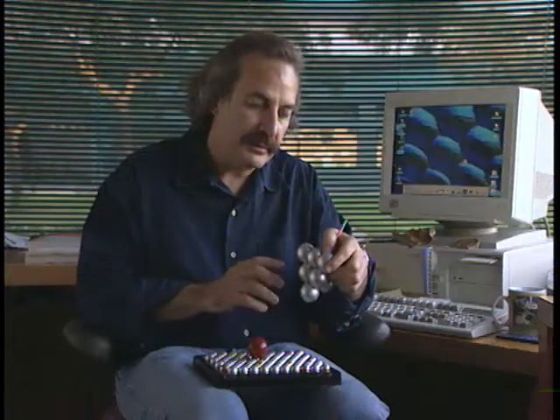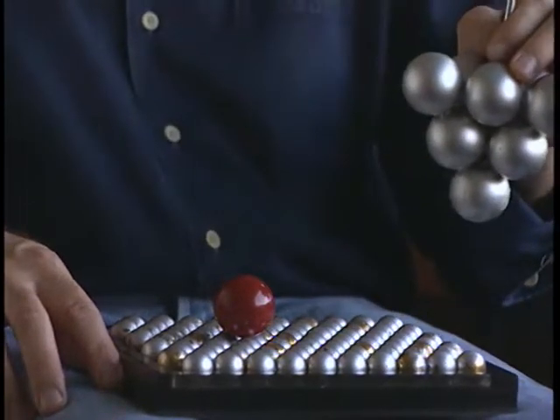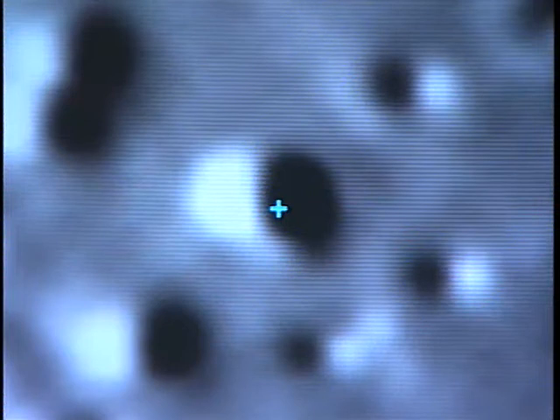When we operate the microscope in the imaging mode, we keep the tip far enough above the surface so that when the tip comes along, it starts to pick up some electric current from this atom. The tip rides up and over that atom and then back down again on the other side. So we can image the atom, and the atom shows up as a bump. That's the trajectory of the tip that we end up measuring.